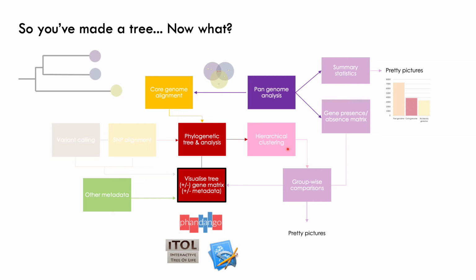And there are tools that would do this for you automatically. Using something like that, and using these clades and that terminology, would really help you make some group-wise comparisons, and again lead to those pretty pictures and how we might communicate our findings. Because what we're really doing is trying to contextualize our findings with what's previously known in whichever species we're looking at. So again, we're heading towards something like what I showed earlier on.